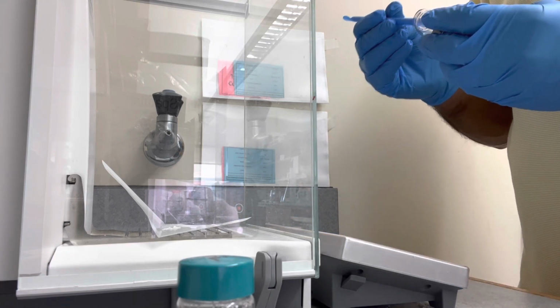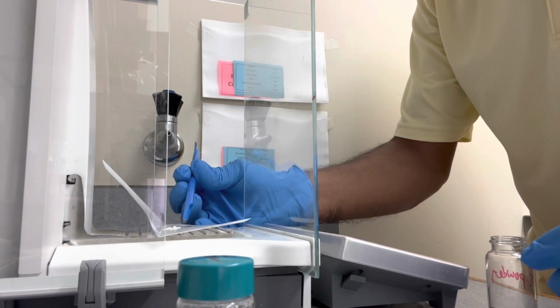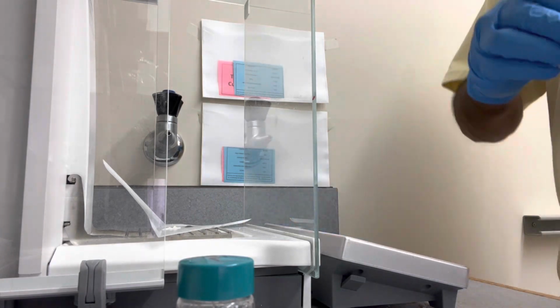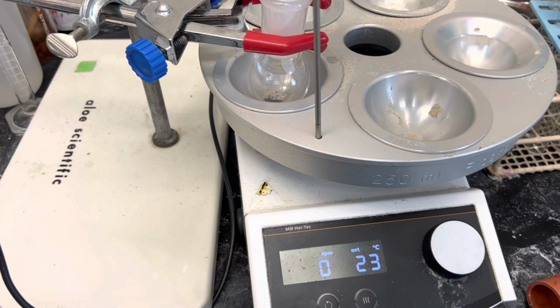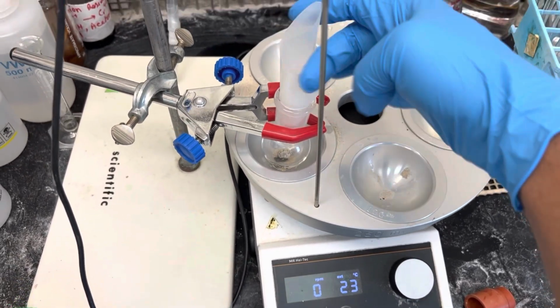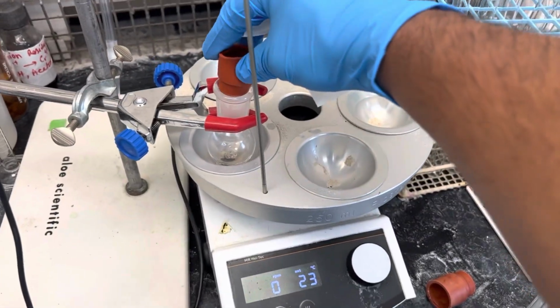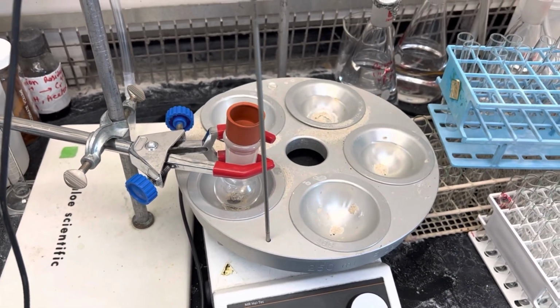Once both solids are measured, I'll take these to my reaction flask. Here is my reaction flask. I'm adding both my compound and the iron powder. This reaction flask doesn't need to be completely dry, like flame dried, because ultimately you are going to use 6 normal HCl, which means HCl with water.